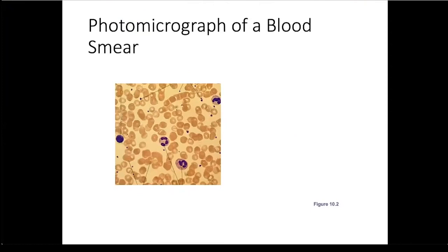This is a micrograph of a blood smear. I have encircled some red blood cells. You can see in the center how they are light colored, and this is due to the thinness where the nucleus used to exist, illustrating the fact that they are a biconcave disc.